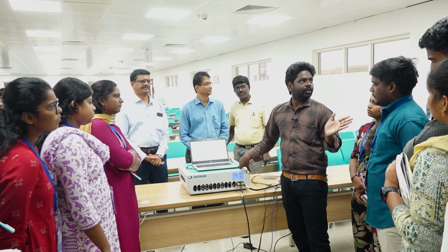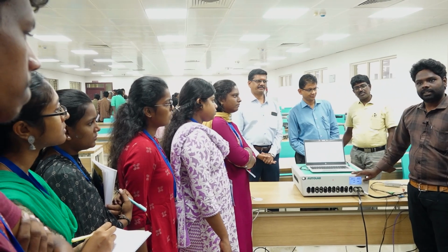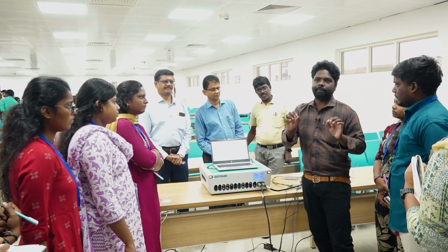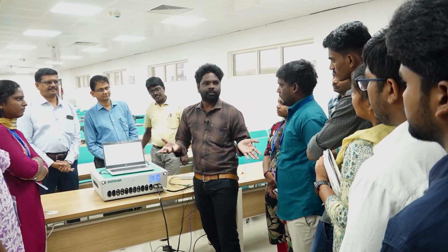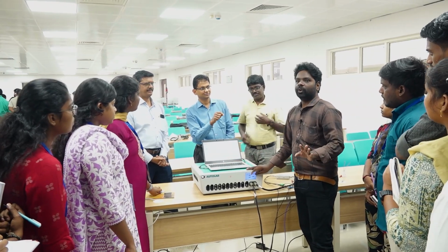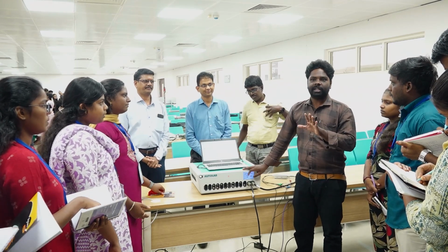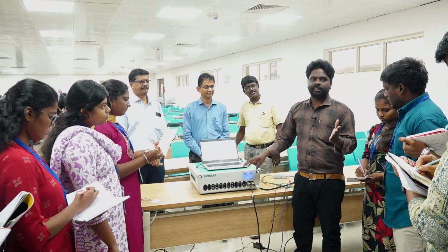Hope you have heard about EIS, or if you are new to EIS, no issues, we will start from scratch. I hope this session will be brief and crisp. So without wasting any time, first of all, EIS is electrochemical impedance spectroscopy.